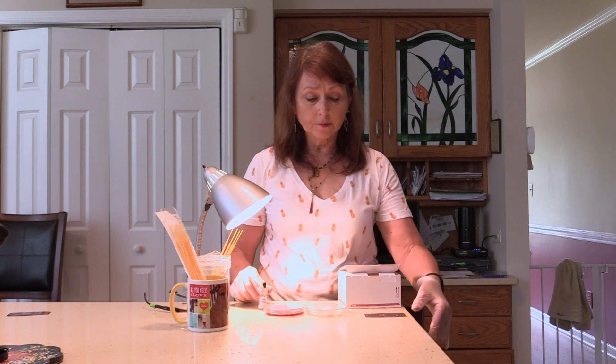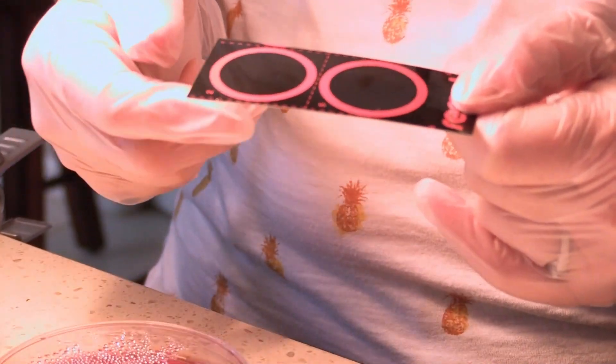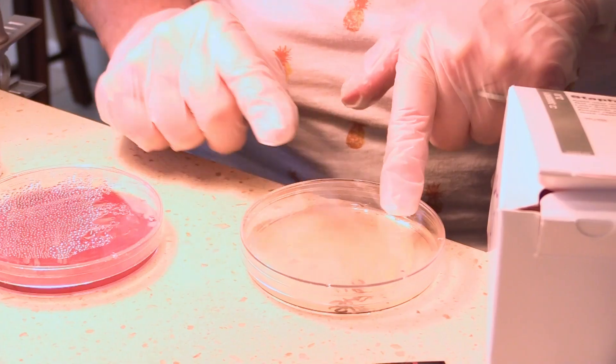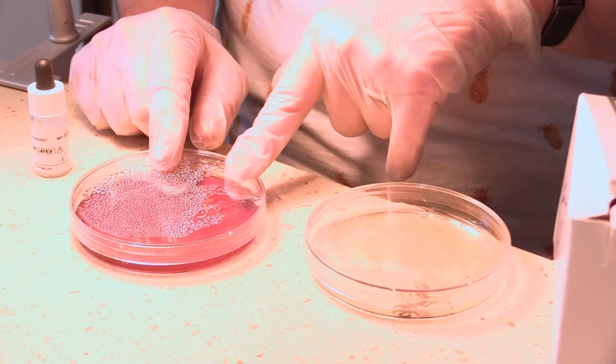The test kit also provides disposable card slides — they come six circles to a slide, but I've cut it down to just two circles. In one petri plate I have Staph epidermidis growing on a Nutrient agar plate. The other plate is my Staph aureus, and I have it growing on a Blood agar plate, which you'll learn about in an upcoming lab.